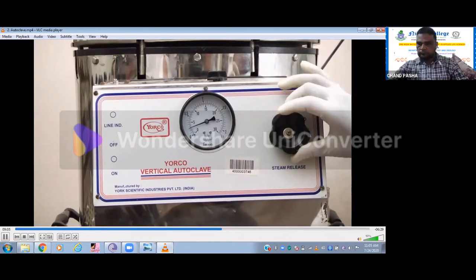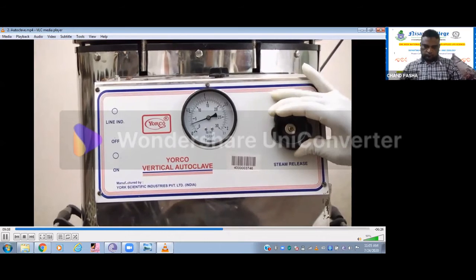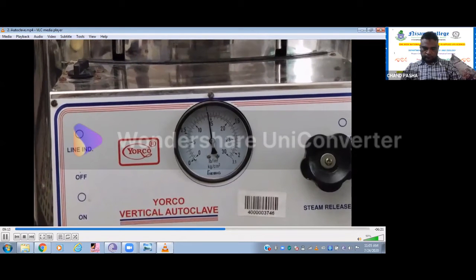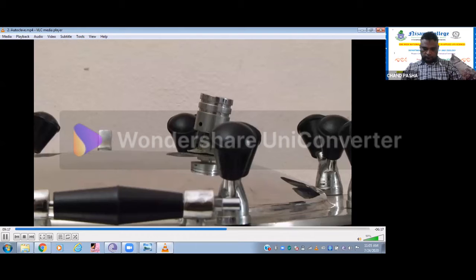Close the air cock. This will cause the pressure to rise and with it the temperature of the saturated steam. When the required pressure has been reached, as shown on the pressure gauge, and the excess steam begins to be released from the safety valve, reduce the heat and begin timing using a timer. The heat should be sufficient to maintain the required pressure for the duration of the sterilizing time.